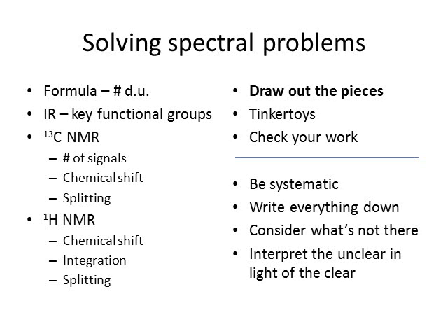And then I look at those and I see, well, how can I attach a chlorine, a CH2, and a CH3? It turns out that particular combination would only have one possible way of putting it together, because a chlorine makes one connection, a CH3 makes one connection, because carbon makes 4 bonds, and a CH2 makes 2 connections. Therefore, the CH2 would go in the middle, and the chlorine and the CH3 would be attached to it, and that's 1-chloroethane.